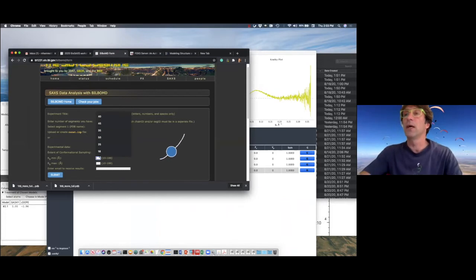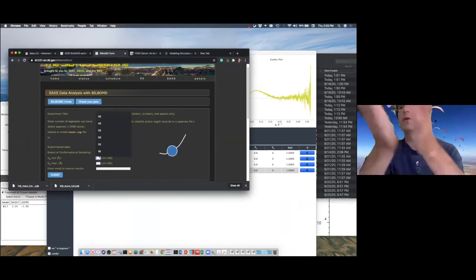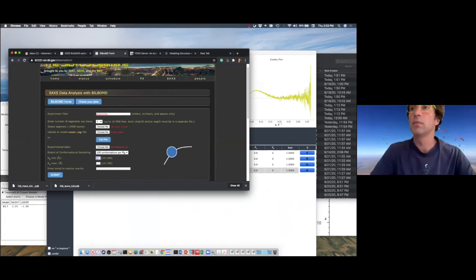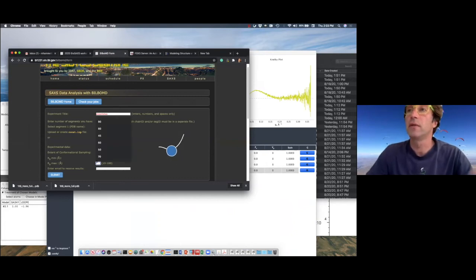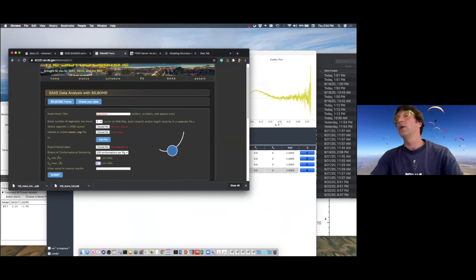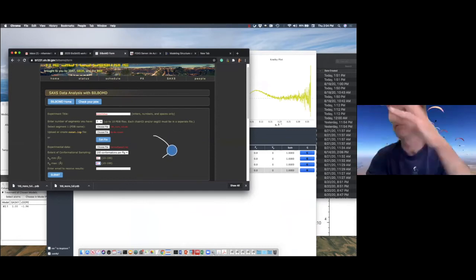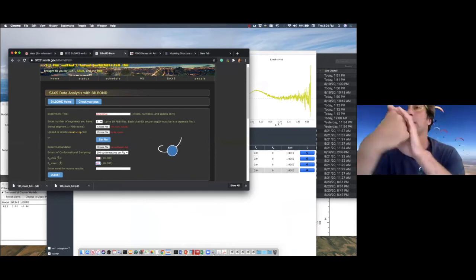Be careful about that. So let's say your experimental Rg is 24, the minimal Rg will be about 20. This is a rough estimate, and you can go as high as, let's say, 40. If your experimental Rg is 50, you want to go from, let's say, 40 to 90, also depending on how much flexibility you expect between those domains that are moving.